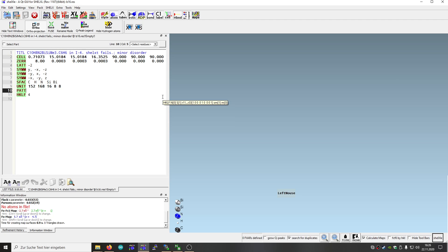Hello, welcome to another ShellXLay tutorial. This time we will solve the structure using ShellXS and the Patterson command, or the Patterson map, to solve the structure.